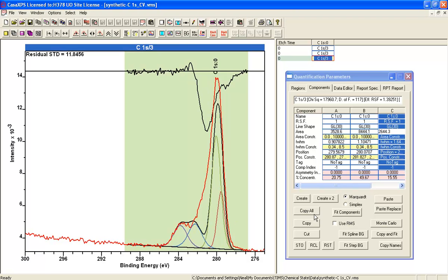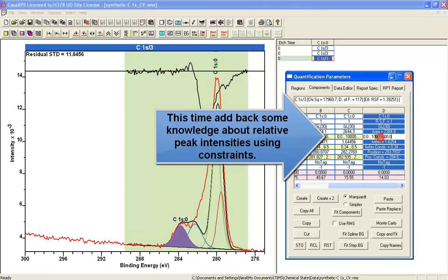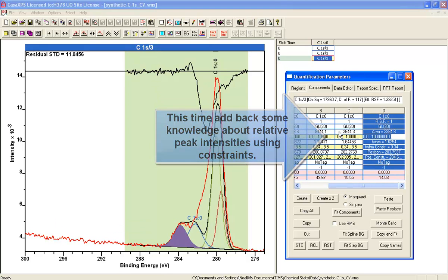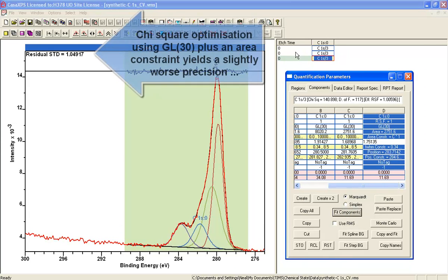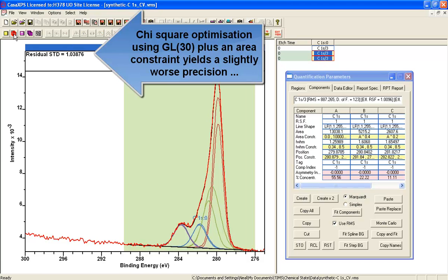So now, if we go to a GL30, this is another slight variation on a theme, but this time what we'll do is introduce some of the information we know about the peaks. And C and D both should be about, in fact, are precisely the same area. And we've got, again, come up with a good residual standard deviation.